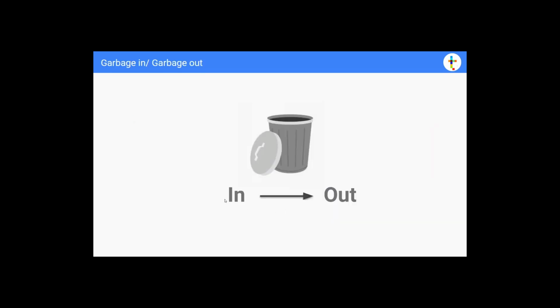So the first thing to highlight is the garbage that you can create if you don't think ahead before you do an experiment. However, I have rescued data even with these issues, but for example, there's a lot of batch variation that could have been controlled, and if you have more variation coming in, it means there's more work to be done on the analysis coming out.